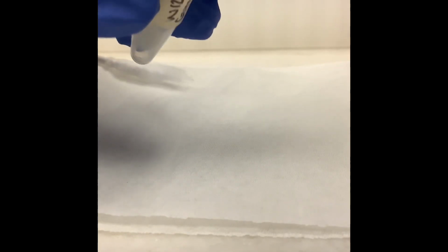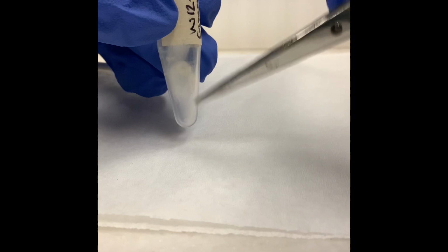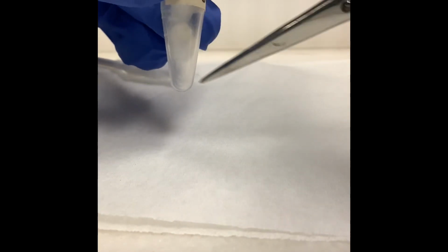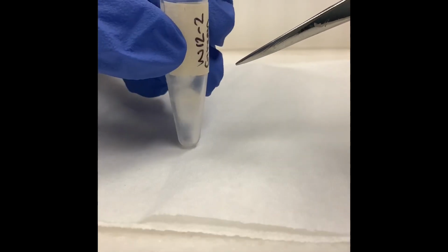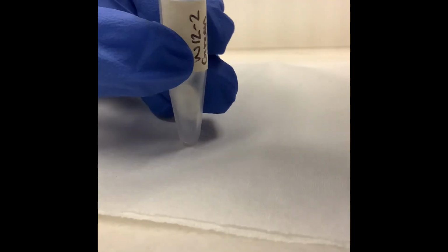It's important that you don't switch tubes at this step because there's probably pollen just sitting around in this specific sample tube. So we want to start the process in the original tube. You're just going to repeat this process for all the rest of the samples that you have.